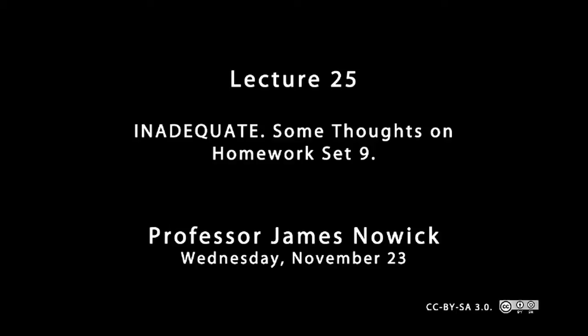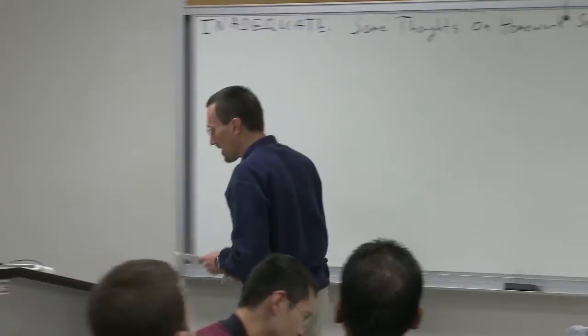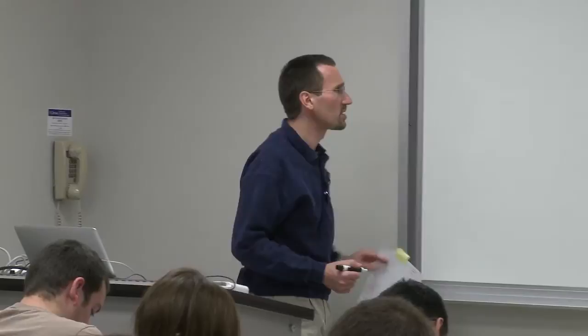I want to talk about two things today. I want to talk about the INADEQUATE technique and then give you some thoughts on homework set 9, and build on some of the stuff that I started to scratch at the blackboard. I worked up something last night with some models that I thought would be really useful for some of our thinking and tie into some of our conformational analysis. So let's talk about the INADEQUATE technique first.